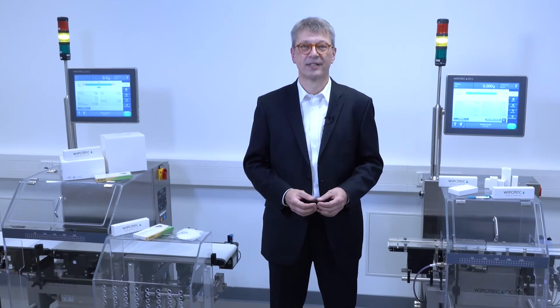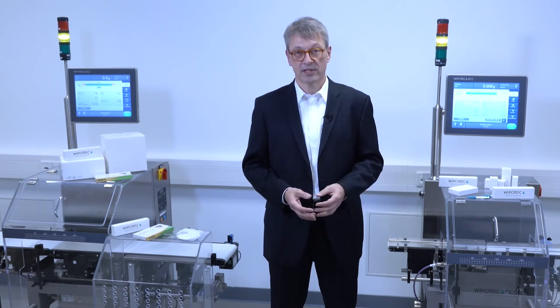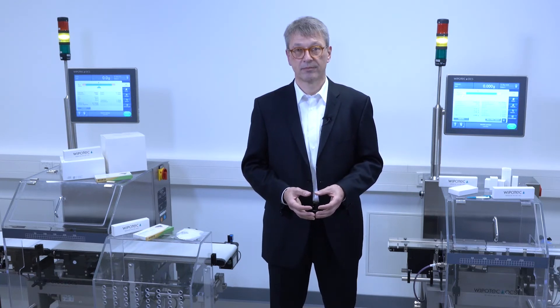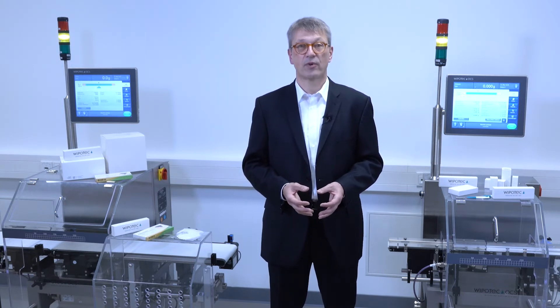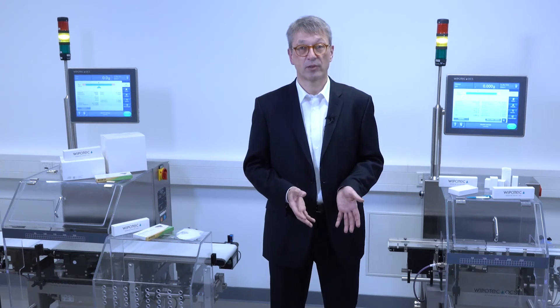Speaking about speed: we have situations where you have stable high speed — 500 continuously — and we have situations where the upstream machine is ramping up and ramping down the speed. Here we have a sequential drive helping the checkweigher follow the same ramping situation as the upstream machine. This ensures stable product handling and very good behavior of the products.